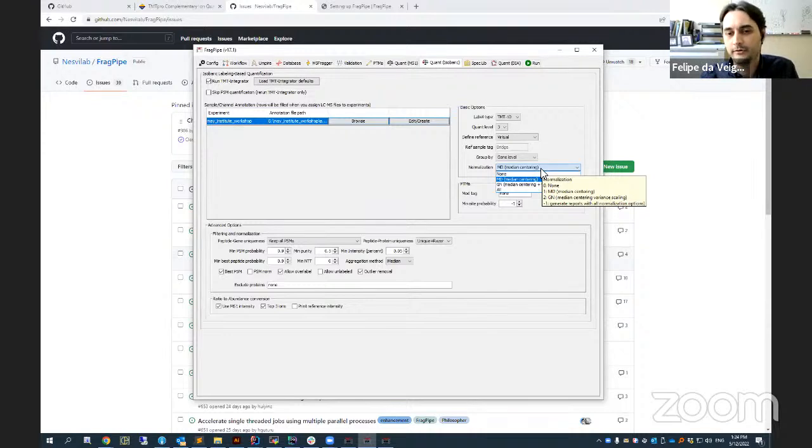But the most important thing, I would say, is the filtering that happens before the median centering. One of the key things that TMT-Integrator does is to filter the PSMs before they get loaded. So things like overlabeling or PSMs with low purity all get removed from the analysis. There is also the selection of what kind of PSMs or peptides are going to be used for the quantification. For example, we normally start with unique plus razor, and that's what we recommend.